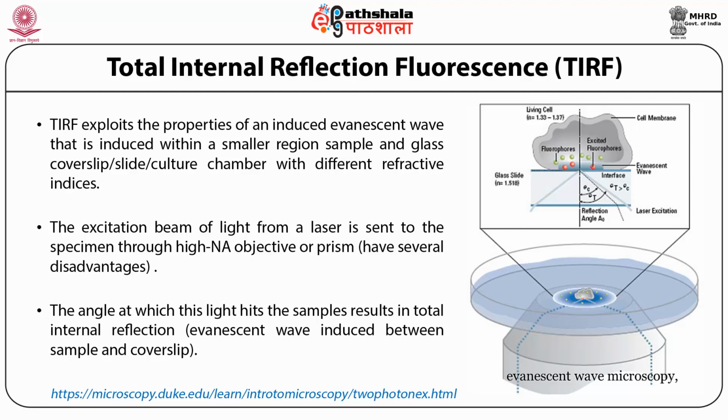So within the sample, if the evanescent wave is generated, we get the signal coming from the sample depending upon its interaction with the waves, and that helps us generate a better quality image.